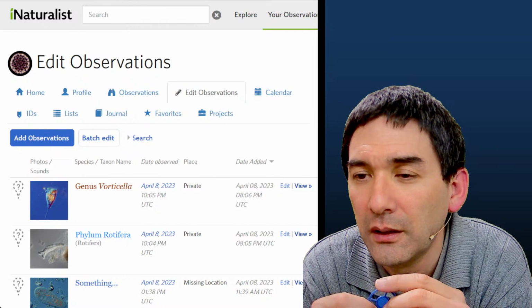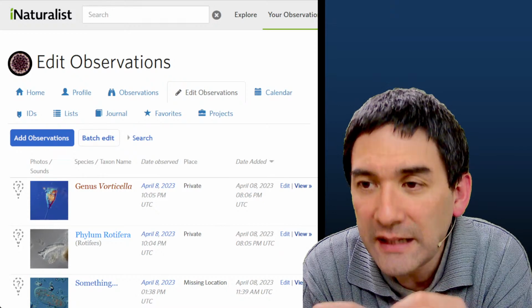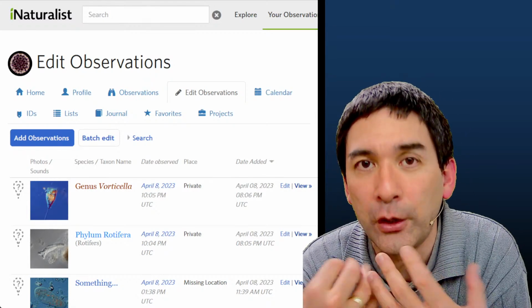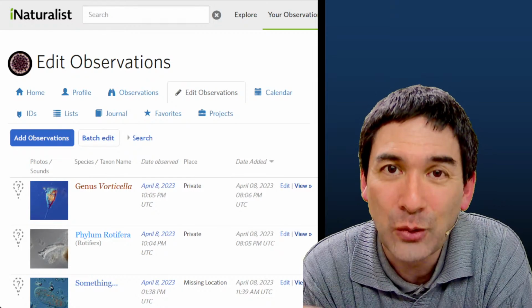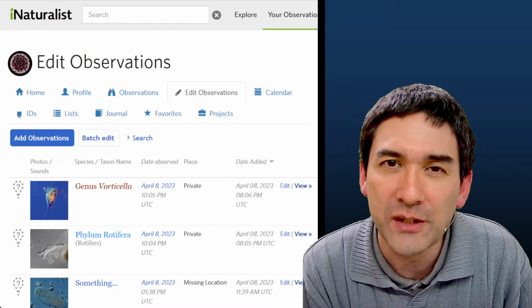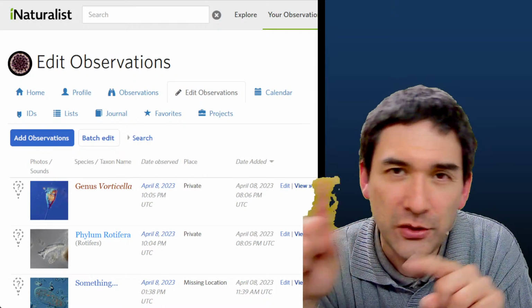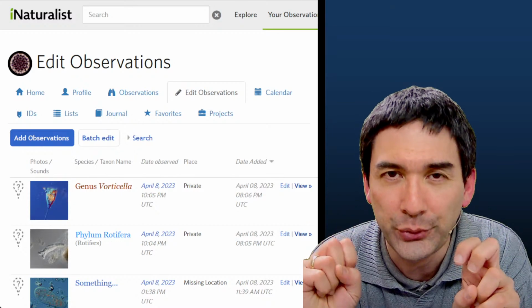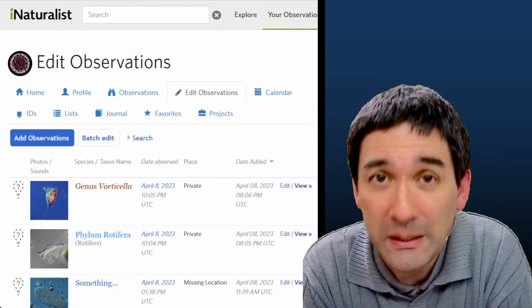That's interesting. Okay. Cable length and type of cable for HDMI will have an impact on image quality. That is correct, but also the camera, because what I read is not all DSLR cameras will actually output a high quality HDMI signal. They will only output the same quality as you see on the little screen. Okay, so it depends a little bit. You have to look for something like clean HDMI, they call it, which is without all of the additional menu and so on. So some cameras have this concept. It's called clean HDMI out, which gives you a high resolution HDMI, which you can actually use to do further image processing.